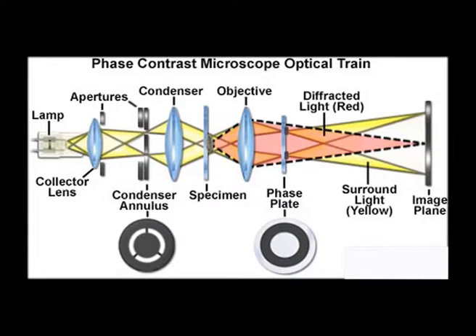So in a thicker medium, the velocity of light will decrease and correspondingly there will be more deviations also. The objects which can actually change the phase of the light ray passing through them are known as phase objects. As light passes through the specimen, it is then collected by the objective which focuses it into the next elements, which may be the ocular lenses, our eyes, or the camera.